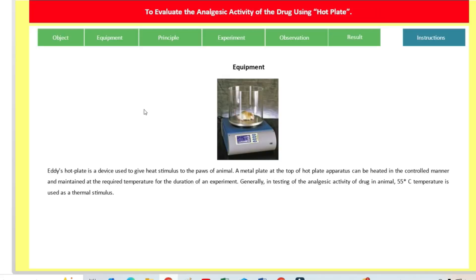Now you will see the heading: to evaluate the analgesic activity of the drug using hot plate. Here you will see the equipment — the hot plate. This equipment is known as the Edis hot plate, and the Edis hot plate is a device used to give heat stimulus to the paws of animals. It was introduced by Edis and Lembeck in 1953, and is used as a simple behavioral screening in pain model.